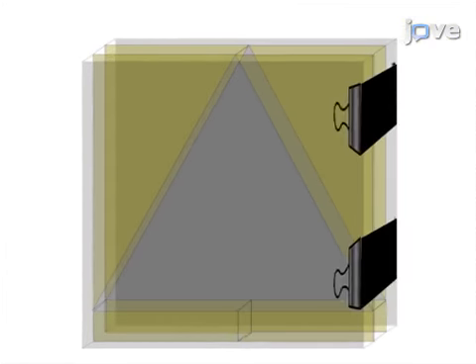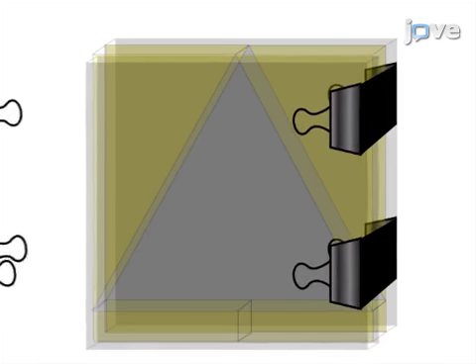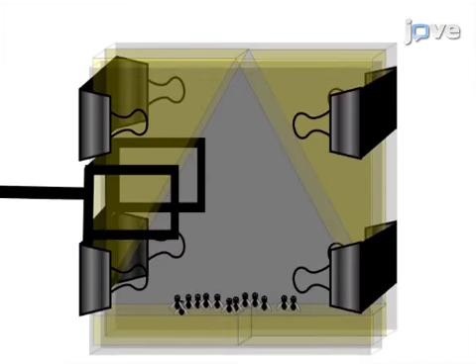Meanwhile, a group of flies is habituated to the environmentally controlled assay room by being transferred into a new vial there. After 2 hours, the group of flies is transferred to the social space chamber. They are tapped down and then positioned vertically with a clamp stand.